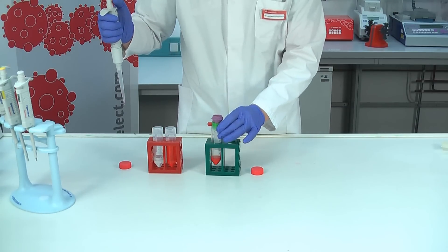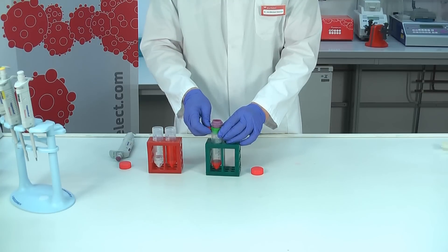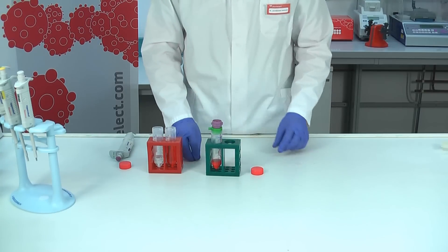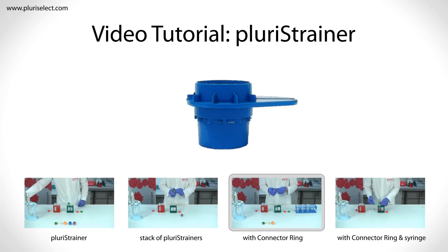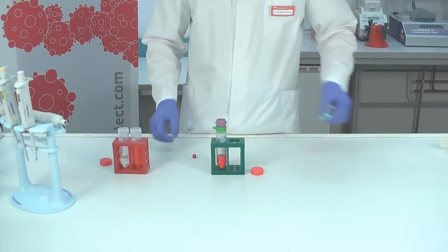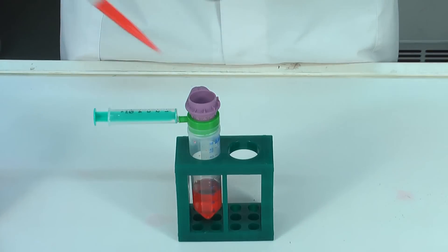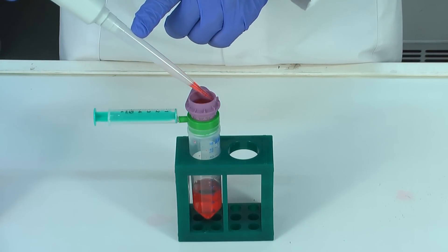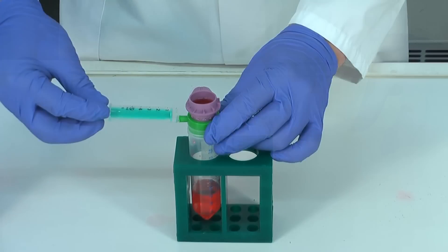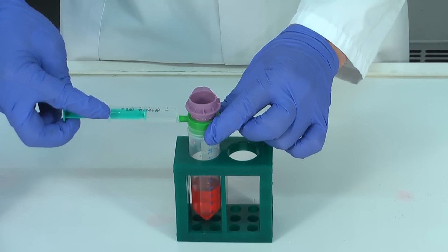It is even possible to force a low pressure while using a syringe in combination with the connector ring. This way you can sieve even rough or more complex sample material, like fat tissue and bone marrow. Add the syringe as shown in the video. Now add your sample material. While pulling the piston, you force low pressure to support the sieving.